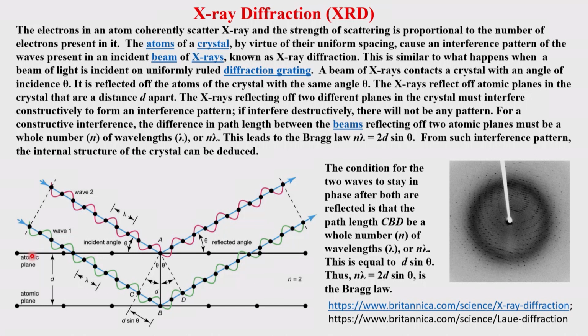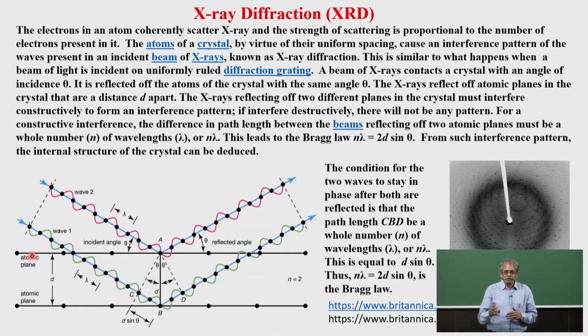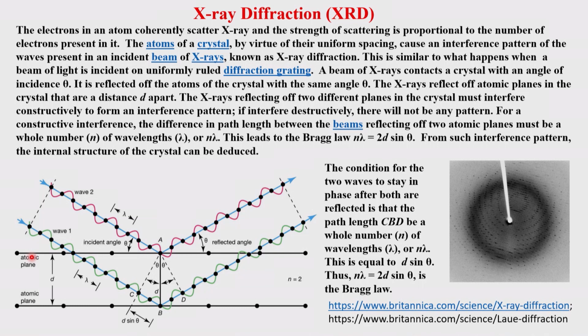I am sure every one of us has studied, even in high school, like 11th and 12th, a lattice, a unit cell, a solid, a crystal, all of these terms, and a little beyond that. So, we will try to build, using those concepts we already know, how one can interpret powder X-ray diffraction, leading to information on the structure, or the type of specimen you have, or the nature of the compound that you have. All those phases, all these kinds of things can be studied. So, for this, the first thing that we need to look at is diffraction.